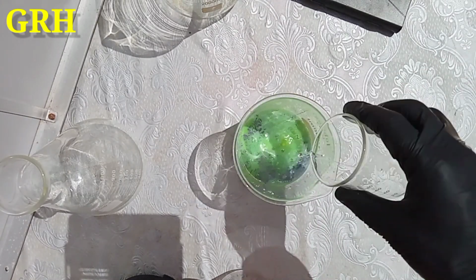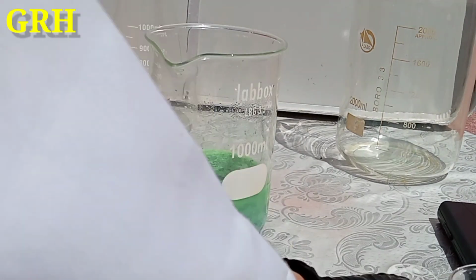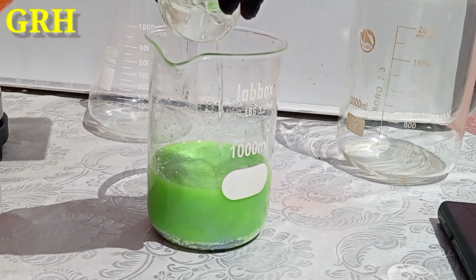Now, drop hydrochloric acid, drop by drop, into the solution. At once, a cloudy, curdy white precipitate is formed. Silver chloride, silver(I) chloride.